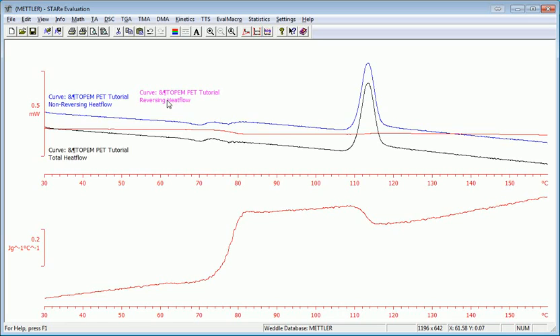The red one is my reversing heat flow. The blue one is non-reversing and the black curve is the total heat flow. And you can see the reversing curve has just the TG in it.